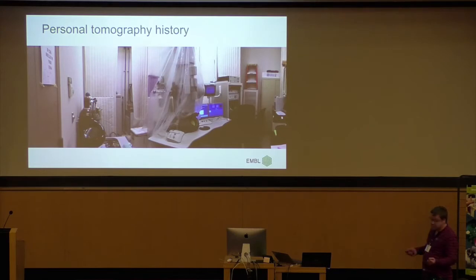So we tested these things in the factory. You learned a bit how tomography worked, especially the tomography 3, the dreadful blue version. The plastic bag, by the way, that's just an old factory trick. You put the plastic bag over it, you have fantastic drift performance. They put a Titan in a box, and I said we put a Polara in a bag. Works really nice. I really highly recommend it.